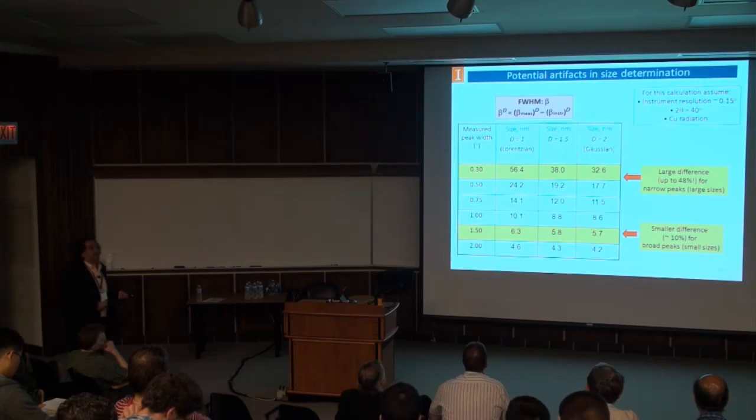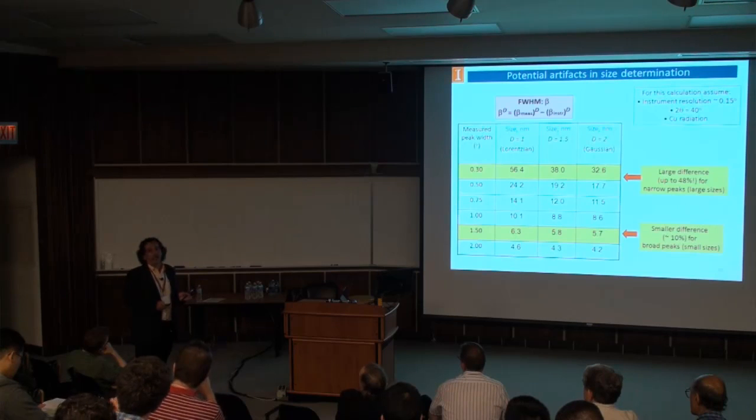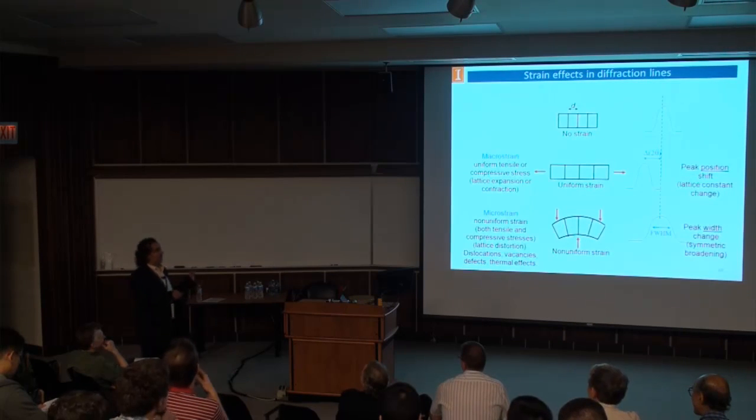So bear in mind, you have to have your instrument function very well determined. Also, be aware on publications. People tend to claim things that they are not careful about. They just, who is this? Poltergeist or something? Okay. Anyway, I was talking about bad things about people.